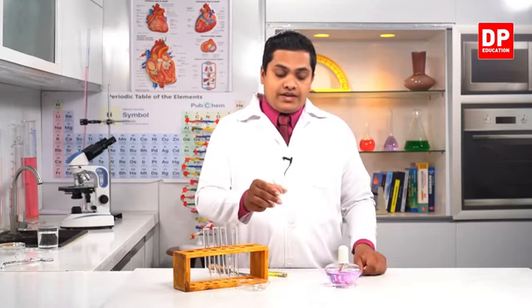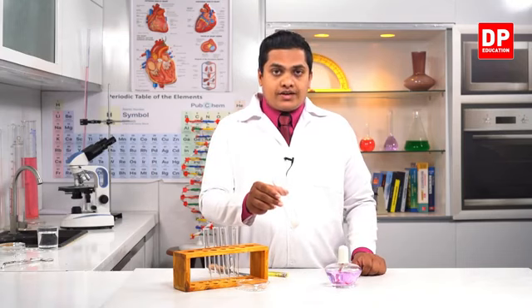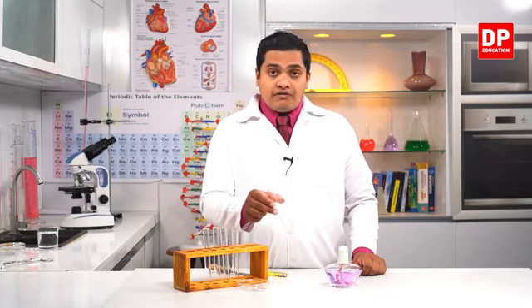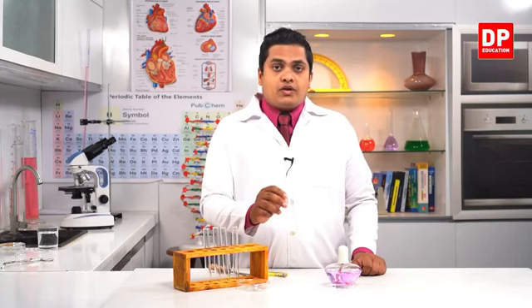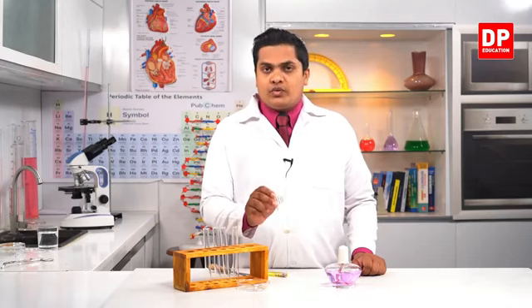When I am heating this solid wax, it is getting turned into a liquid wax. Once again, when I am cooling this liquid wax, it will turn into a solid wax. Here, the solid state has changed to a liquid.